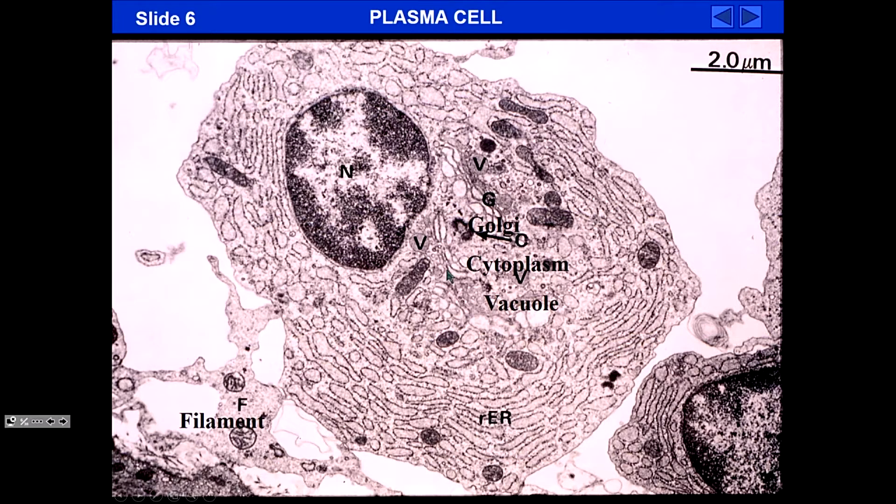And of course, if those lymphocytes, B lymphocytes, become activated, we recognize plasma cells which are producing lots of antibody. We know how to identify a plasma cell because typically it has an eccentric nucleus. The nucleus may have a cartwheel arrangement of the heterochromatin, and of course it has an abundance of rough endoplasmic reticulum producing lots of immunoglobulins. Any questions?